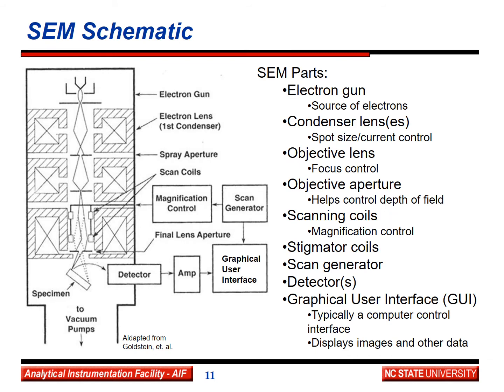Shown here is a schematic of an SEM. At the top of the column, we find an electron gun. In the schematic, this electron gun is represented as a conventional thermal emitter electron gun with a filament, a Wehnelt cap, and an anode plate that accelerates the electrons down the column. Just below the electron gun, we find the condenser lens set. There are typically 2 condenser lenses in an SEM, which work together.